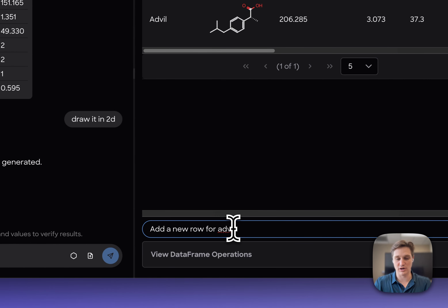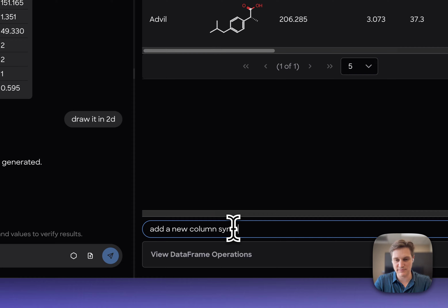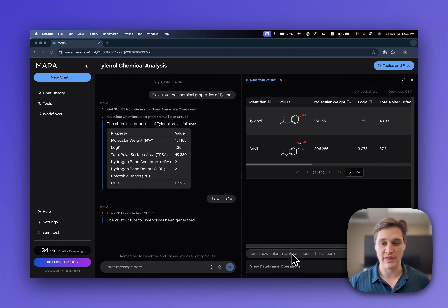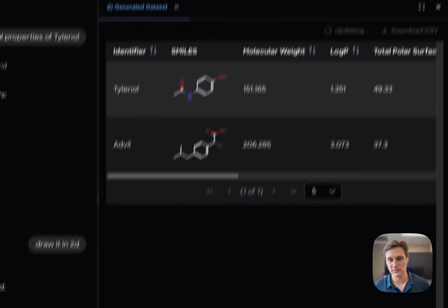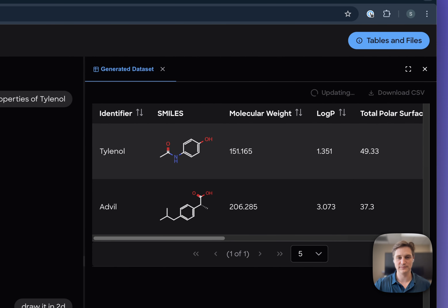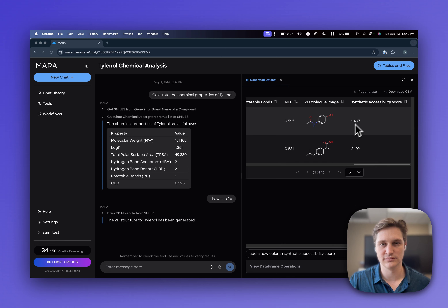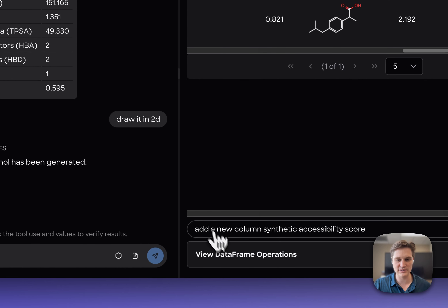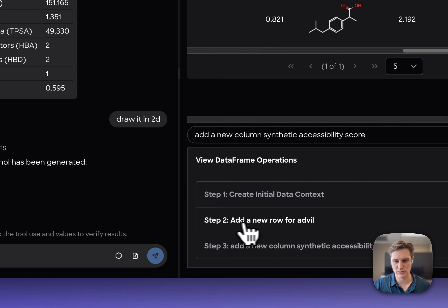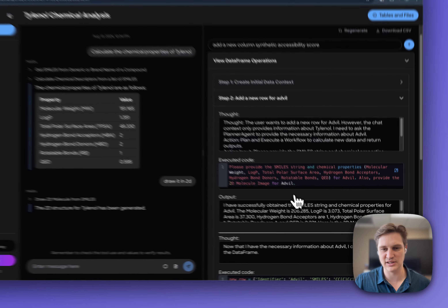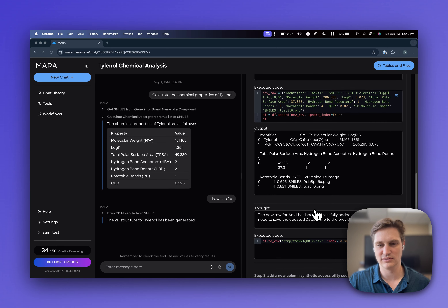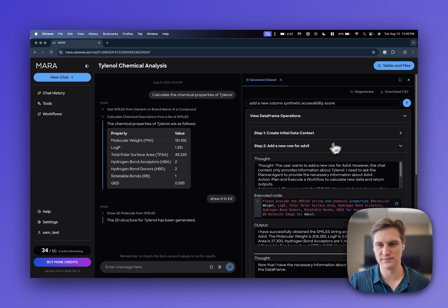We can add a new column as well — maybe for an additional chemical descriptor like synthetic accessibility score. It will check what tools are available, create a new column, and go ahead and start doing operations to add it. You can even drag and drop an SDF file to automatically construct a SAR table for quick analysis. The synthetic accessibility score has now been populated for both entries. We can even look at the previous dataframe operations that were done — in this case, add row for Advil — and scroll down to see the thought process and executed code around tools and tool use.